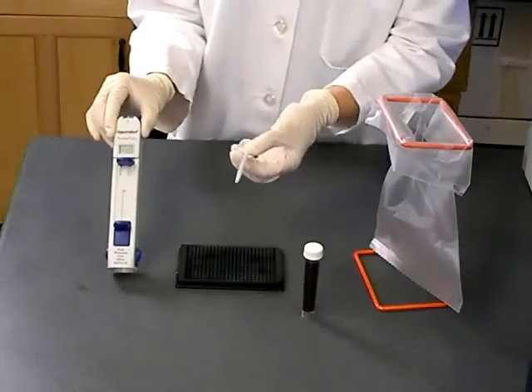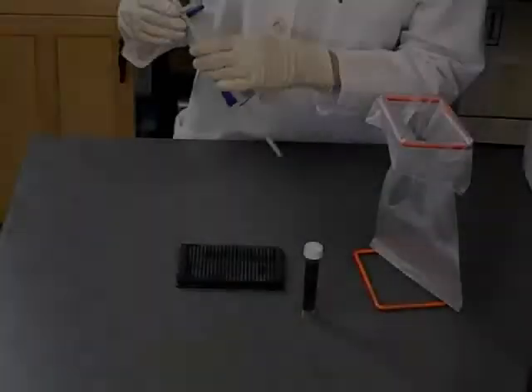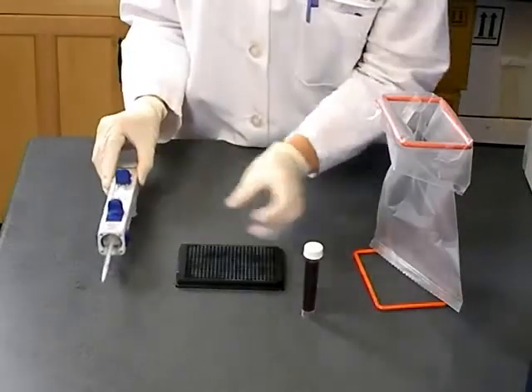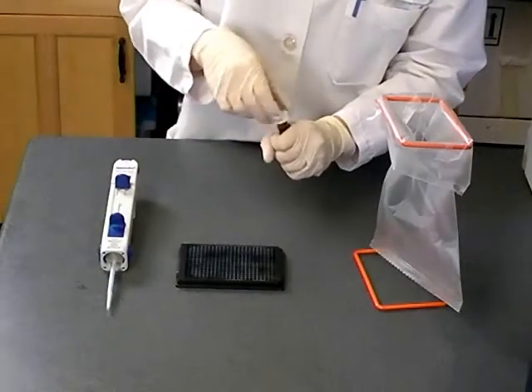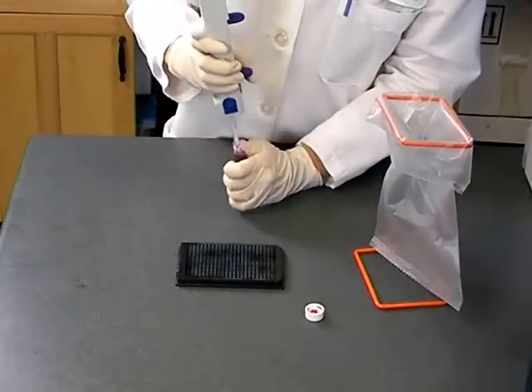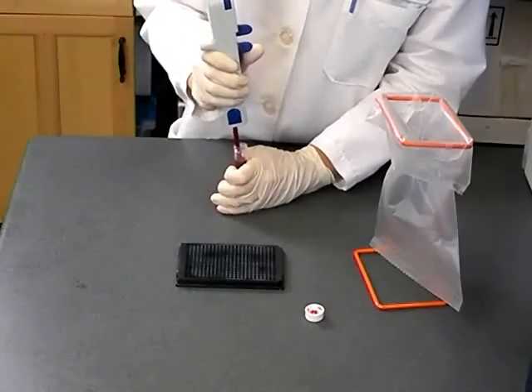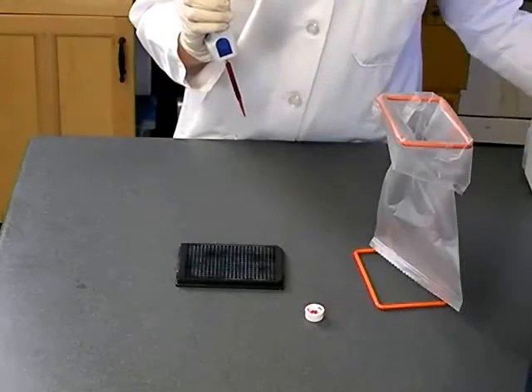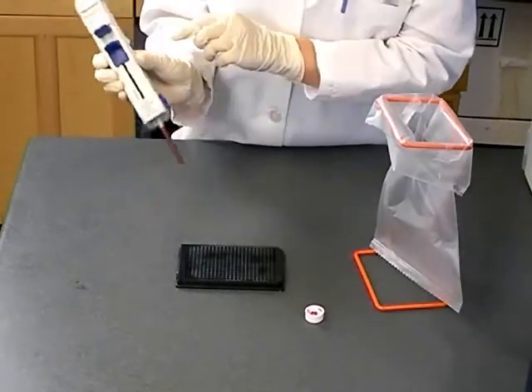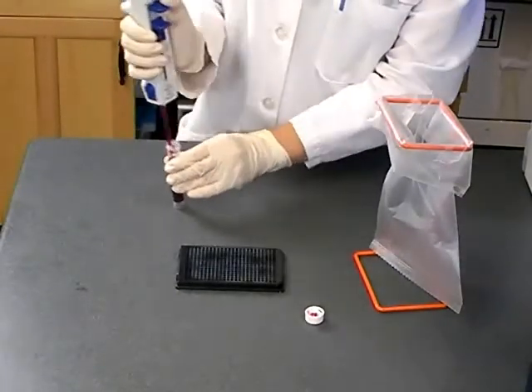Apply a 1ml pipette tip by squeezing the blue buttons and pushing the tip onto the pipette, then release the blue buttons. Set the pipette to dispense a 10 microlitre volume. Carefully place the pipette tip into the blood vial and pull up the filling lever to take up blood. The display will start blinking to indicate that the first amount dispensed will be inaccurate. Dispense one aliquot back into the blood vial by pushing down on the button.